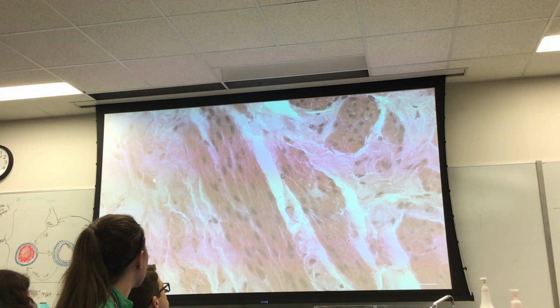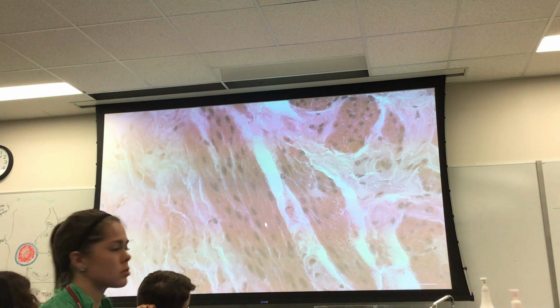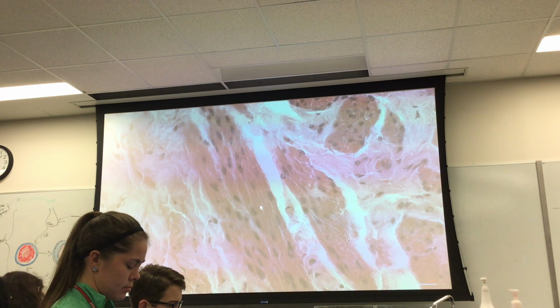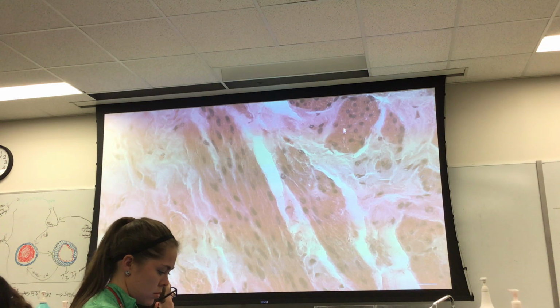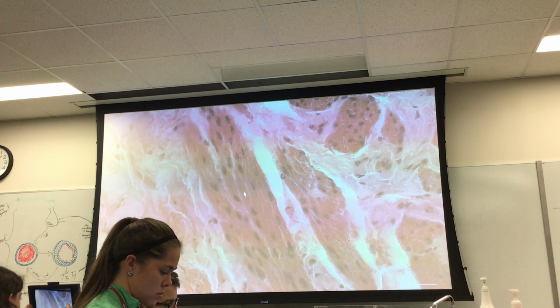So if I showed you this, is that helpful? See how it's staying the same, just a different orientation? That's smooth muscle. This is smooth muscle in longitudinal section. Remember I said always check the context. This is smooth muscle cut in cross section. Definitely challenging, I agree. But I want to draw your attention to the staining difference.